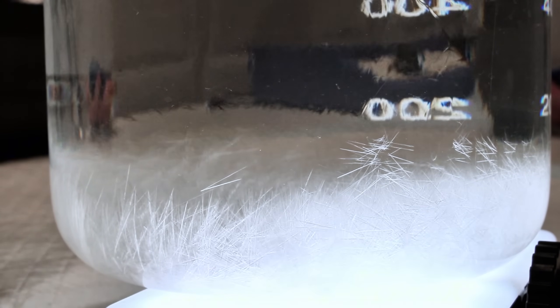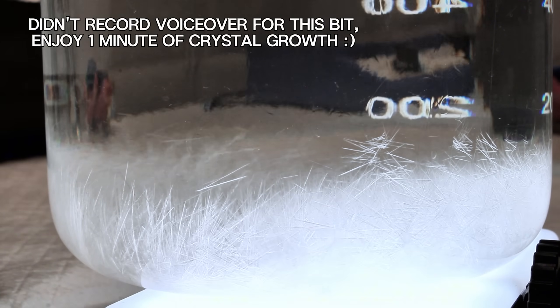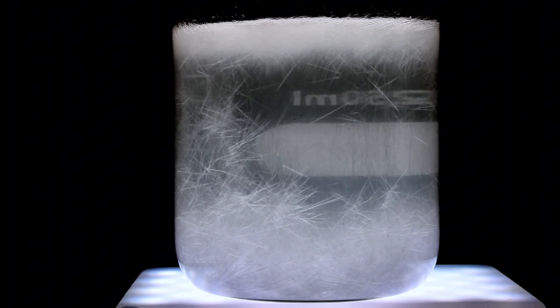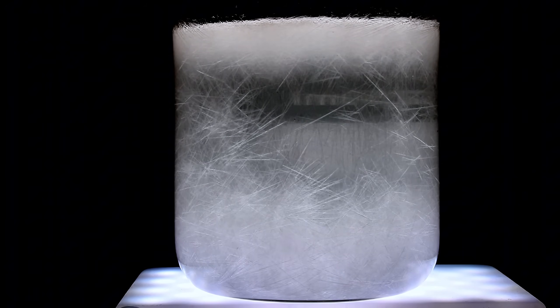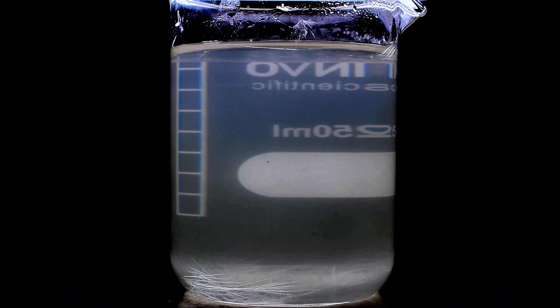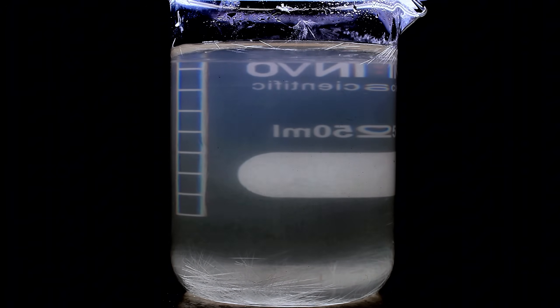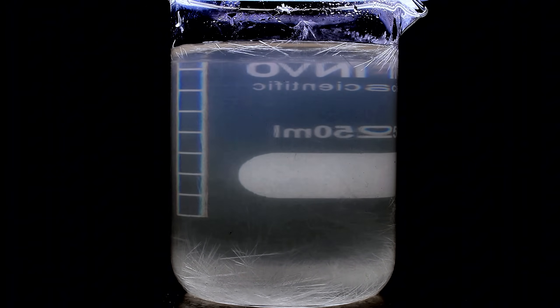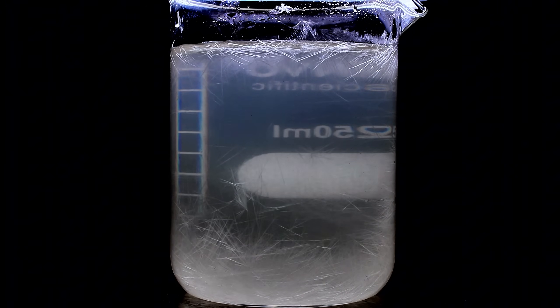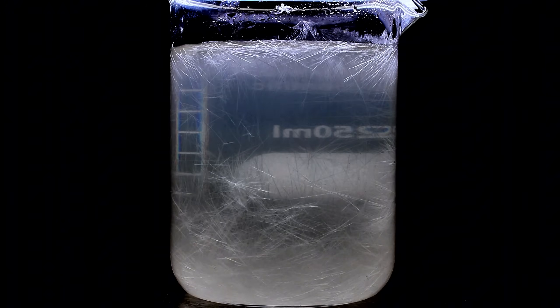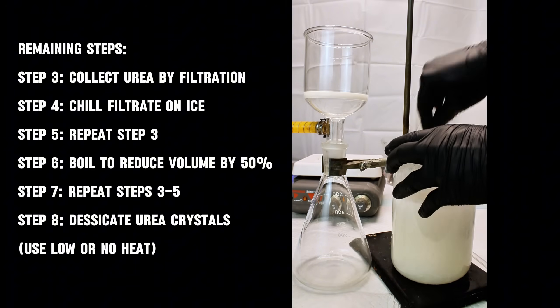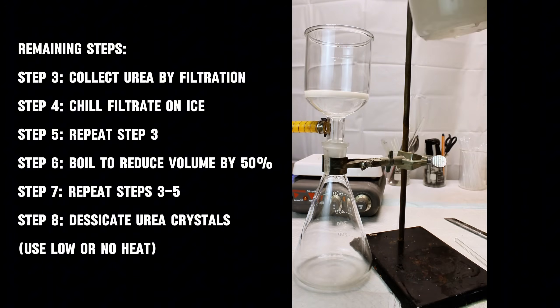As the urea solution cools, it will form long needle-like crystals that seem to start from the bottom of the beaker and move up to the top. After the solution has been allowed to cool to room temperature, I break up the urea crystals as best I can and collect them by vacuum filtration.